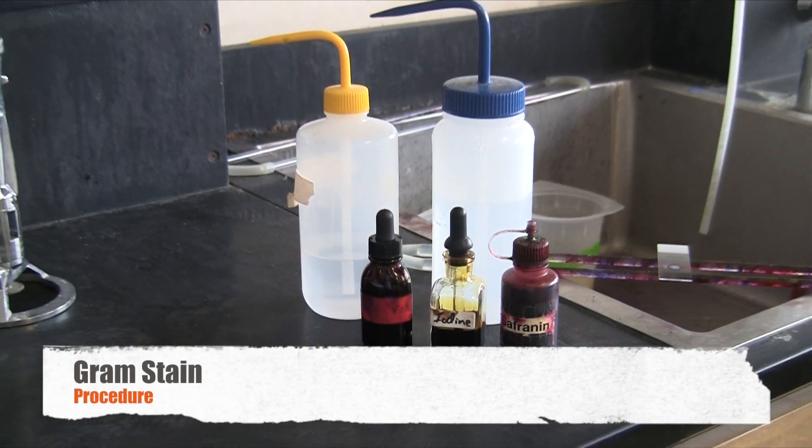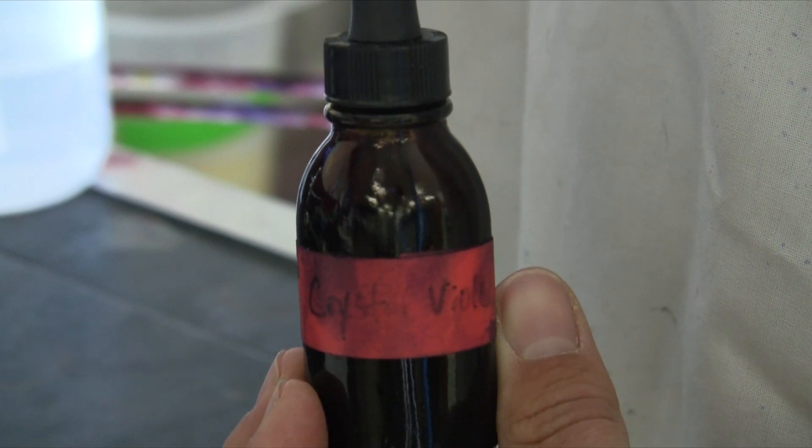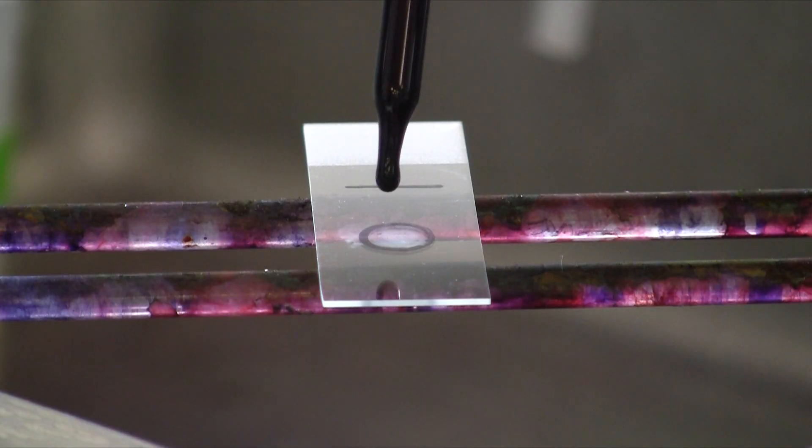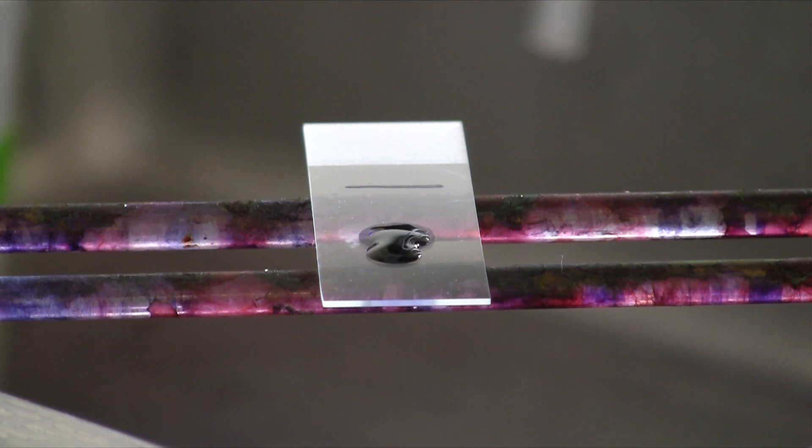The Gram stain is the most important stain in all of microbiology. It's your biggest tool for identifying unknowns. We'll begin with the crystal violet dye. Place this onto your smear prep and let it sit for one minute.